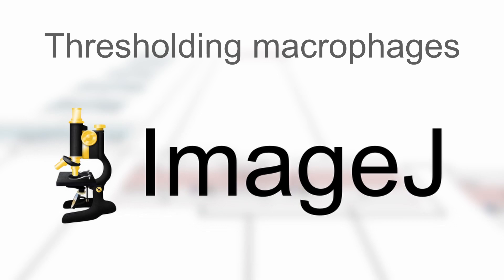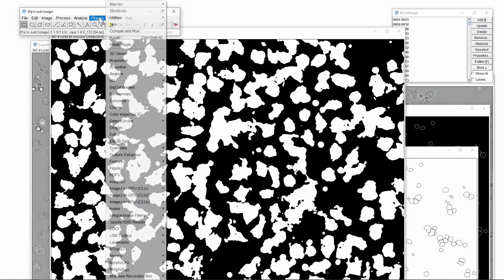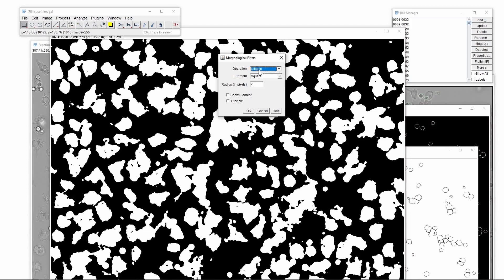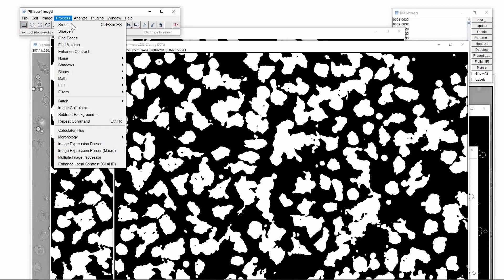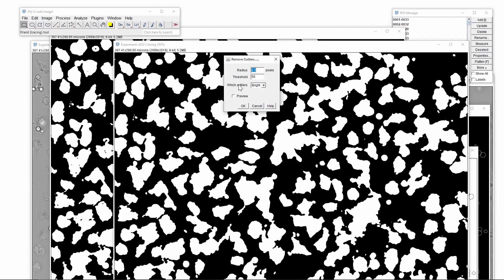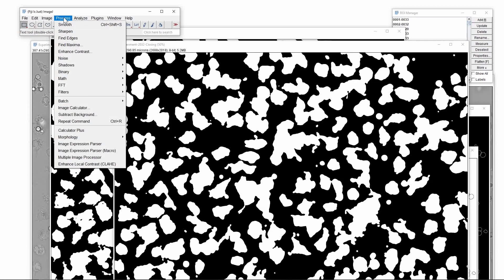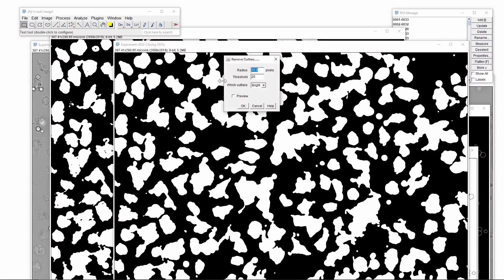And now we go back to ImageJ. We now go to the roughly segmented binary image. First we apply a closing algorithm using a disk element and 2 pixels of radius. Next we will fill the remaining holes in the image. The image still contains unnecessary small elements which are not macrophages and we will remove them now using the remove outliers command. First we set the threshold to 20 and then the radius to 10 pixels.